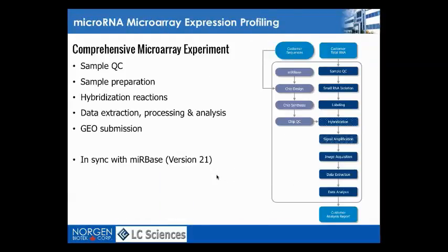When you're starting out, you probably have a particular sample type in your hands, and you have a question that you want to solve. And there are the different methods out there: qPCR, microarrays, and next-gen sequencing, or miRNA-seq or RNA-seq.